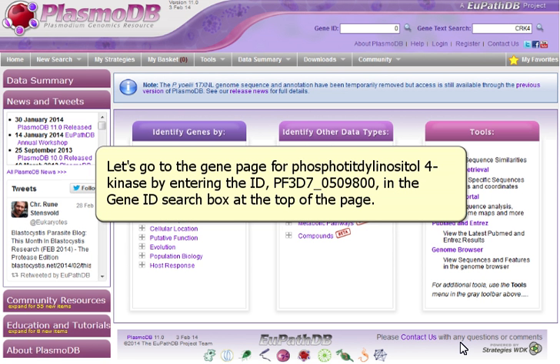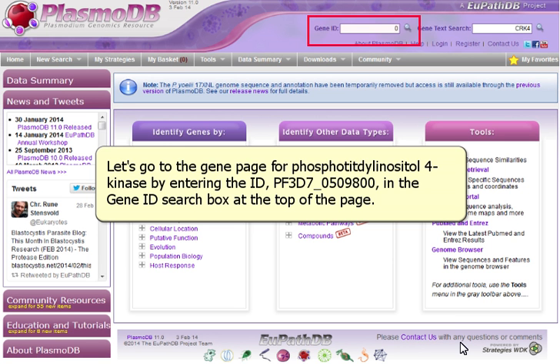Let's go to the gene page for phosphatidyl inositol 4-kinase by entering the ID PF3D7-0509800 in the gene ID search box at the top of the page.